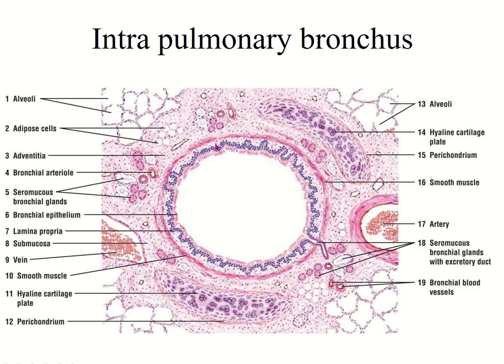Then it contains the next layer, the lamina propria, the loose connective tissue, and it also contains a large amount of elastic fiber longitudinally arranged. And this mucosa is ended by a smooth muscle layer. You see the staining, it gets more staining than the rest of the tissue.